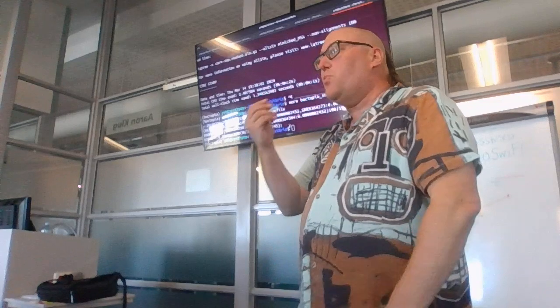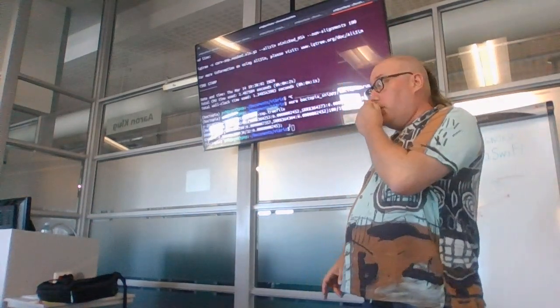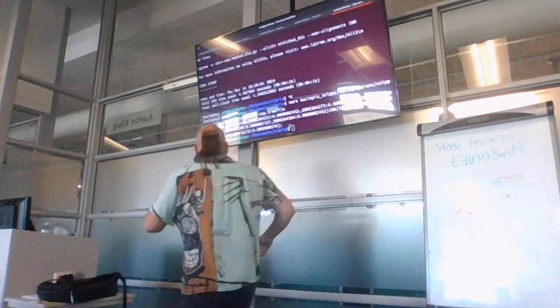Mycobacterium tuberculosis is a pure culture. You grow this thing from pure culture. If you contaminate with anything, it's going to show up in your sequencing. But yeah, I think there are a lot of gaps, and it's not just bioinformatics gaps. But anyway, let me get back to the data.